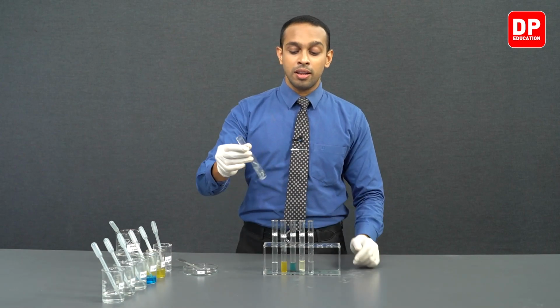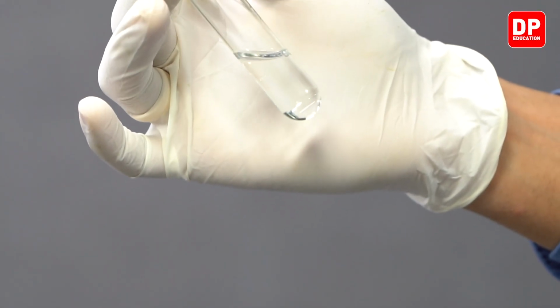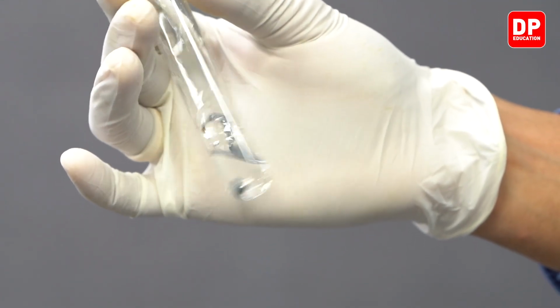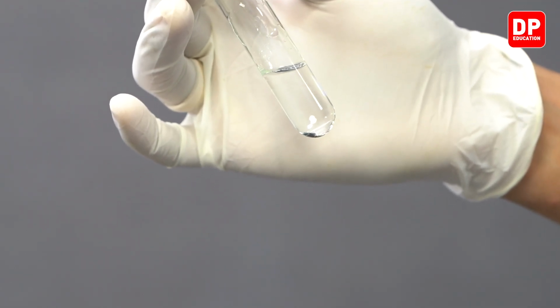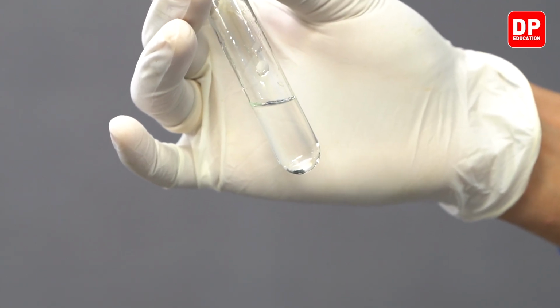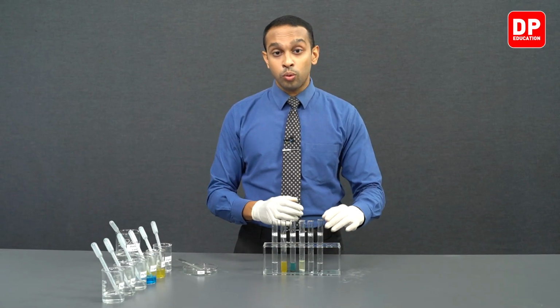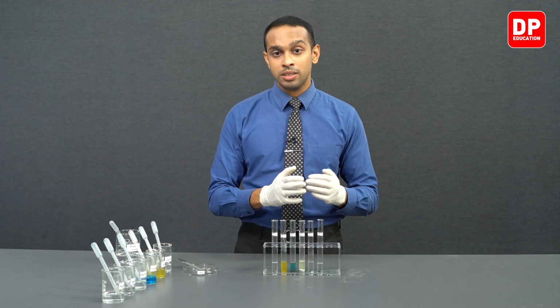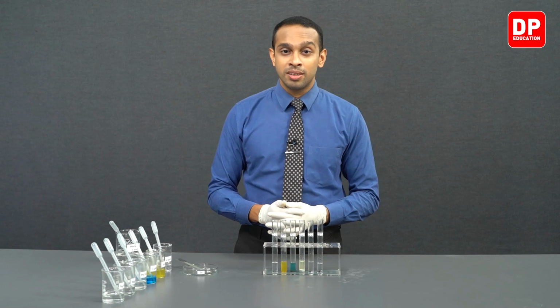Finally, students, our last test tube in this experiment has Na+ aqueous ion solution added with a zinc metal. Do you observe a color change here? Do you observe a precipitate that is formed here? The answer would be no. In the presence of zinc, Na+ aqueous ions do not get displaced. That means sodium is more reactive than zinc, or zinc is less reactive than sodium. That is why zinc metal was not able to displace Na+ ions as sodium solid.